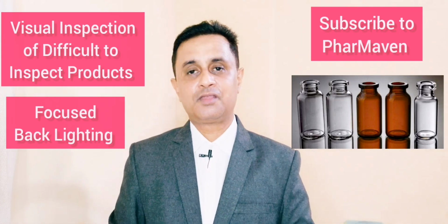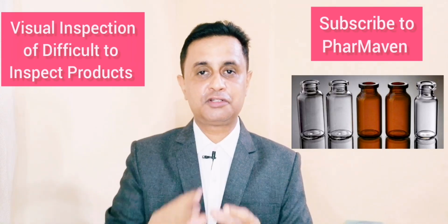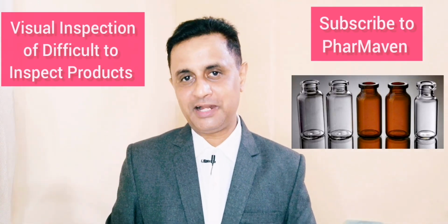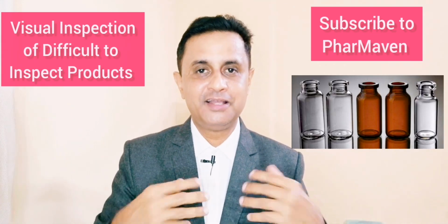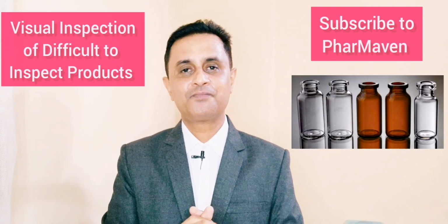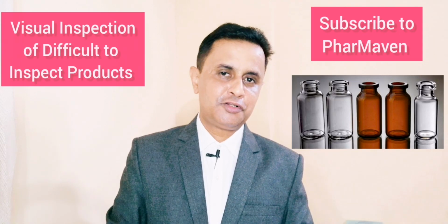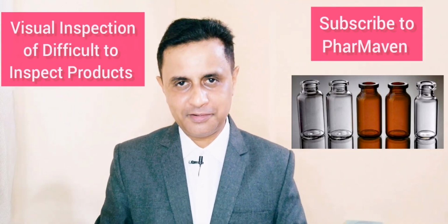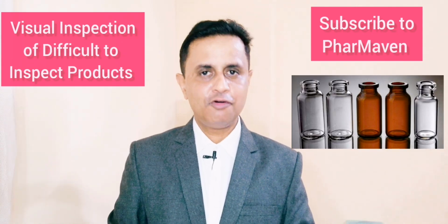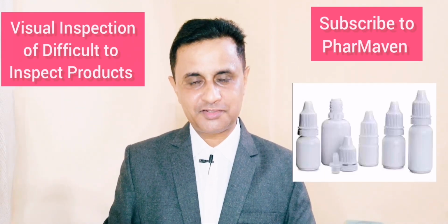What else can be done is transferring that amber color content to a clear glass vial or clear container. Again, that has to be done in a controlled environment so that it will not induce any additional external contamination leading to false rejection. So we have to do this transfer in a controlled environment, maybe under LAF, so that it will not introduce external contamination to the container, and that way you can do the inspection of the amber color vials.